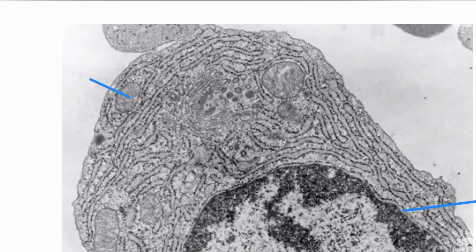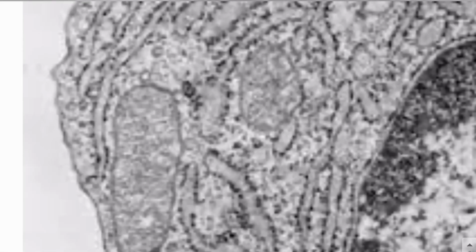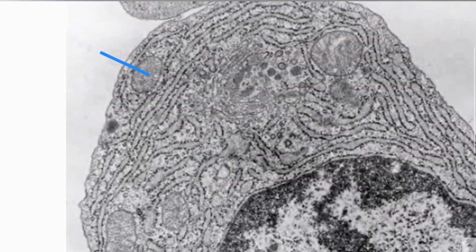How do we actually recognize the mitochondria? When we see the mitochondria, we will see some dark regions and some light regions. And if we look very carefully, we can see the lines in the mitochondrion. These lines are the lines of the cristae, right? So you will see some light structures, some dark structures in the mitochondrion, and it will have a characteristic shape.